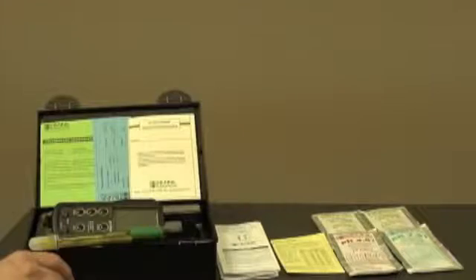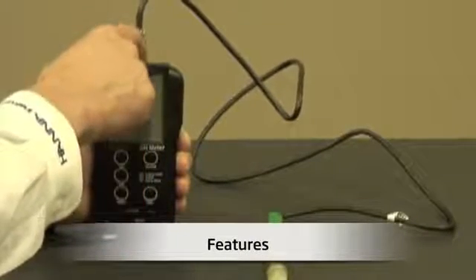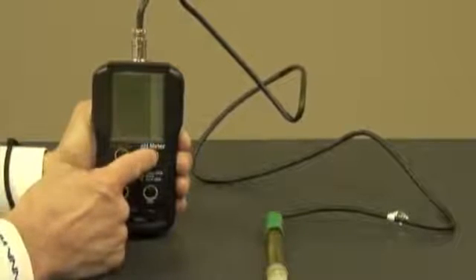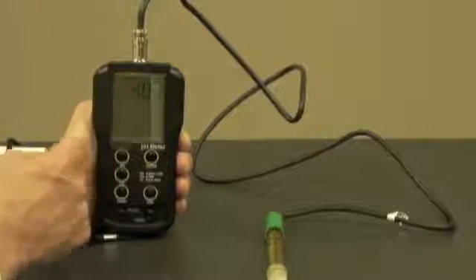Next, let's talk about some features. Now that I've installed the batteries and connected the probe, I'm ready to turn the meter on. The first thing I'm going to see is the battery indication level, followed by the pH reading.